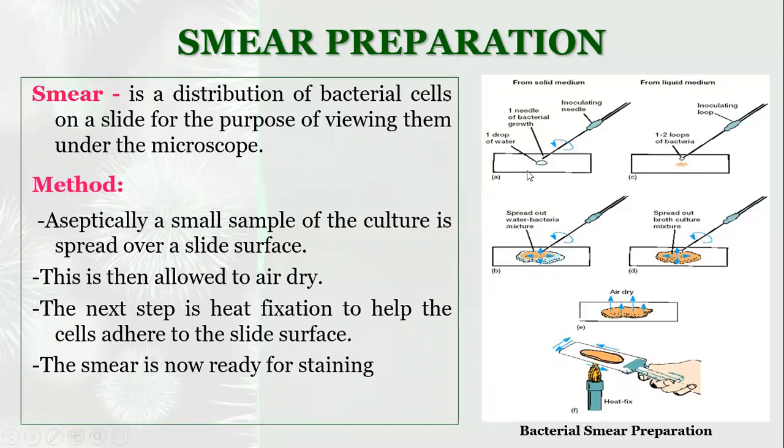If it is a solid medium, first you need to take a drop of sterile water. Then with the help of an inoculation needle, mix the bacterial culture so that it mixes up properly, and then spread the organism on the microscopic slide. Here you can see the spreading of the organism along with the water drop.